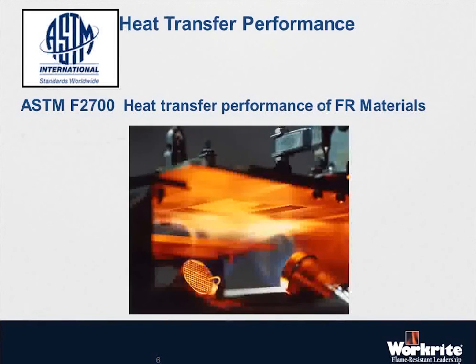I don't have a video on this one, but when you look at the apparatus, you can see down on the bottom side, you've got some burners and some flames producing a 2-calorie heat flux exposure, again with both radiant and convective heat. And you're measuring the heat transfer through the fabric, which is in the center, up onto some sensors. Again, you're measuring it over time against a curve that shows when you're going to get some burn injury.